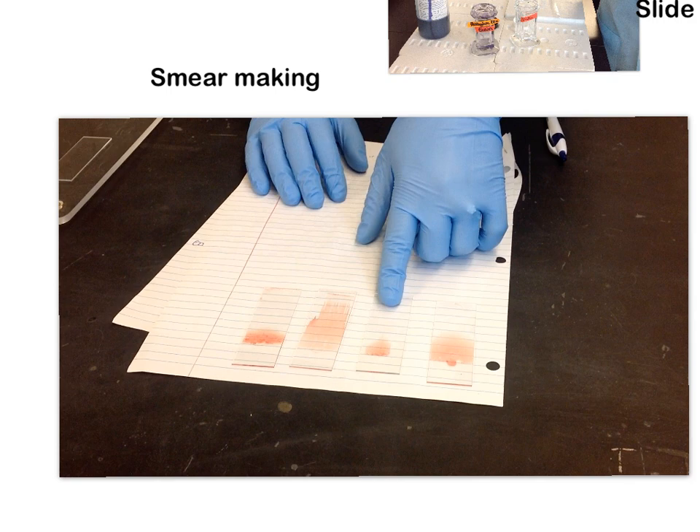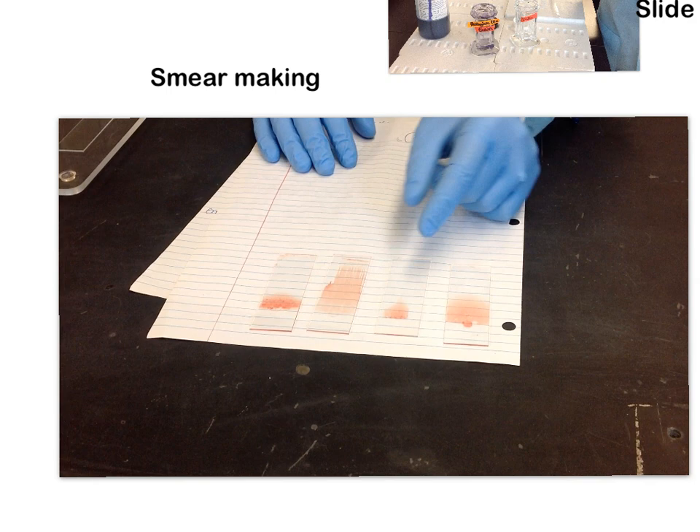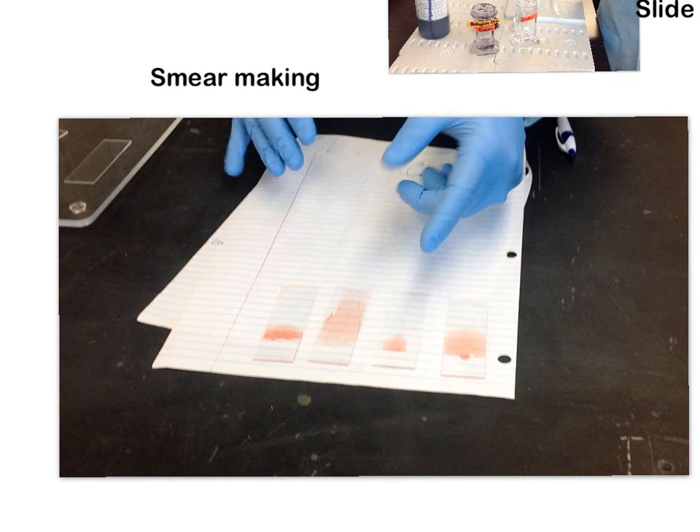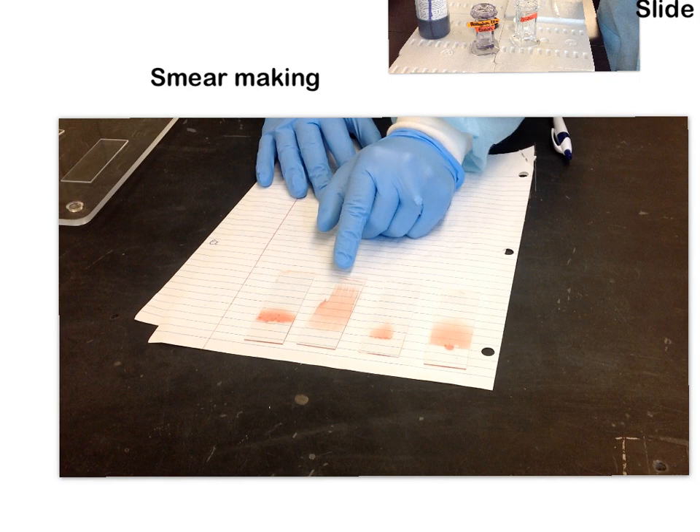This next smear is what I would consider a little short, dinky smear — and it's not good for several reasons. It's too short, not wide enough, and too thick. I would not want to look at this smear because everything in here would be really jammed together, making it very difficult to discern cell morphologies.